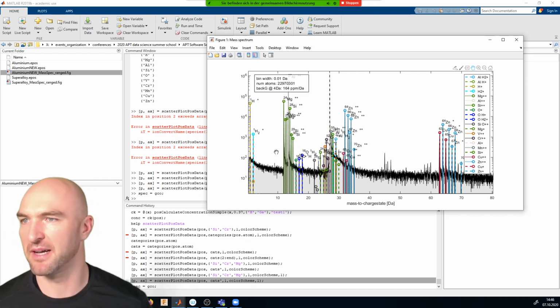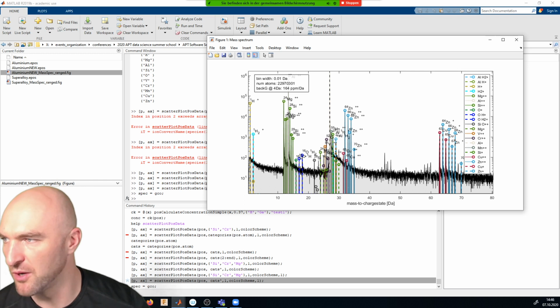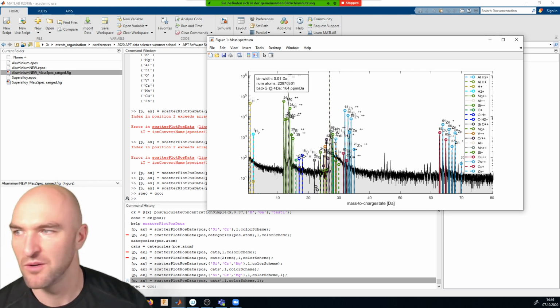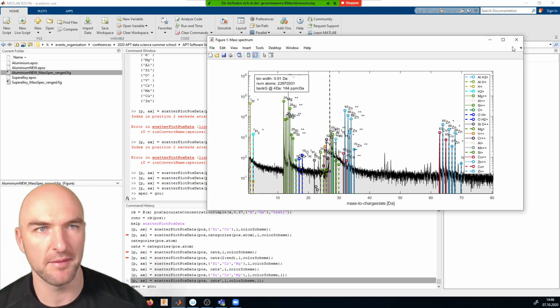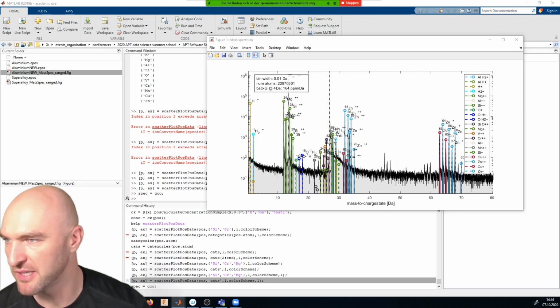Okay, everyone apart from Florent could at least open it. Okay, David, you couldn't open it either. What error? Can you share your screen maybe? Okay, so if you have an undefined function or variable tiledlayout, then you're definitely on an older version of MATLAB.